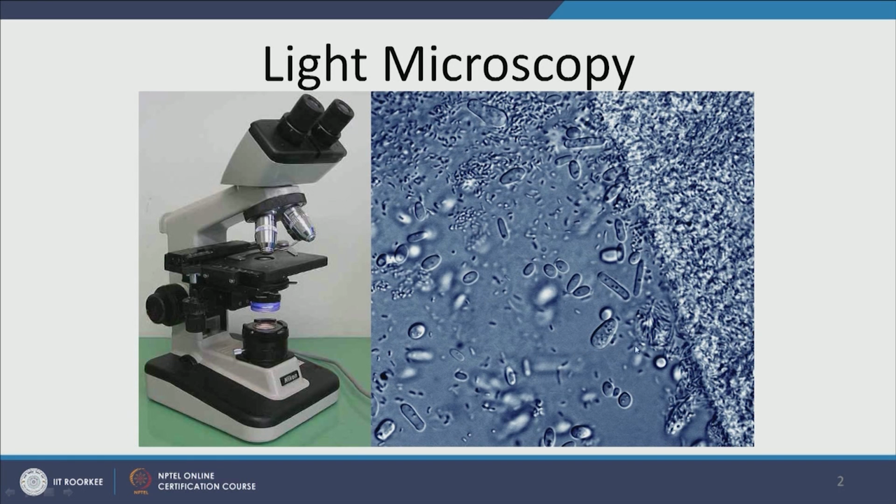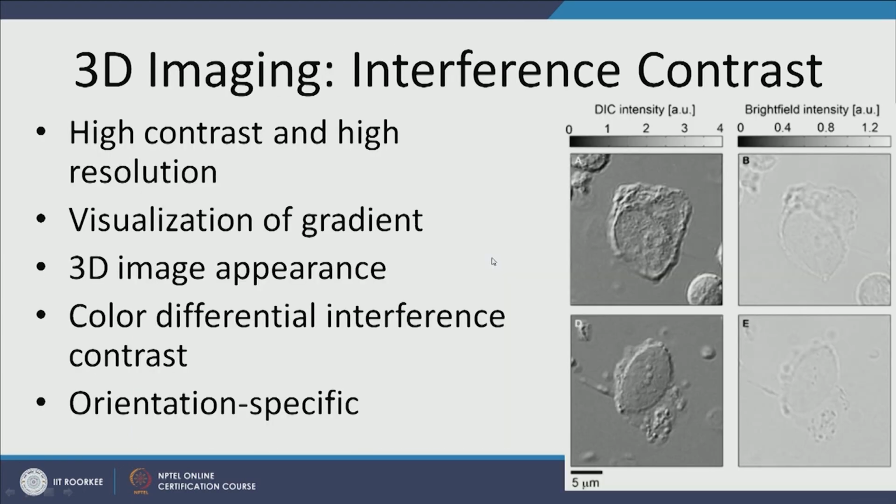This picture on the right is a static image seen by light microscope. It has different kinds of cells in it, eukaryotic and some prokaryotic as well. It's important to note that what you see here is a static image of what you might actually observe under the light microscope. More often than not, we see these small microbes undergoing motions. They move around, either in Brownian motion or as actual microbes whipping their way around in the solution.